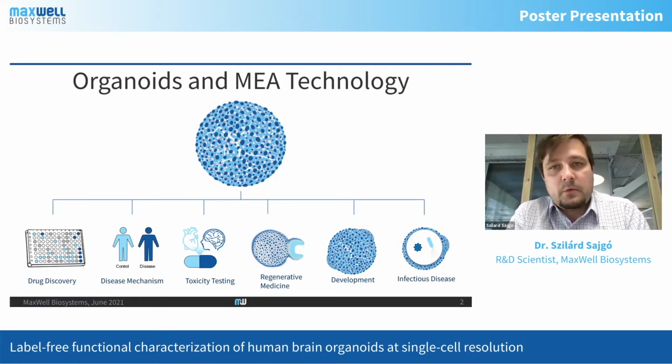How can they help? Well, their three-dimensional architecture is critical to organ physiology and function, and allows for the development of cell types, thus it recapitulates aspects of in vivo physiology more accurately than its two-dimensional counterparts or even sometimes animal models. Now, what aspects of biology can one study using organoids in combination with microelectrode arrays?